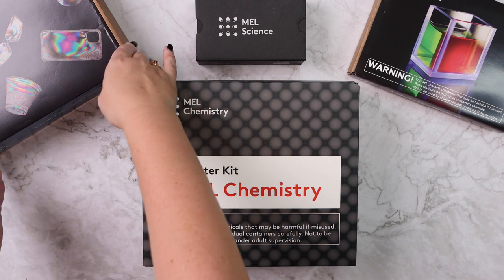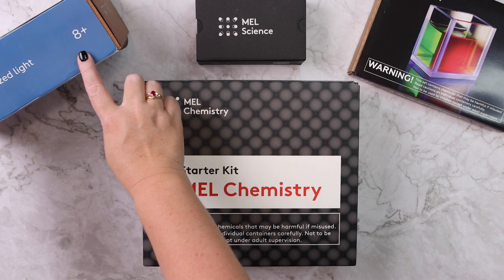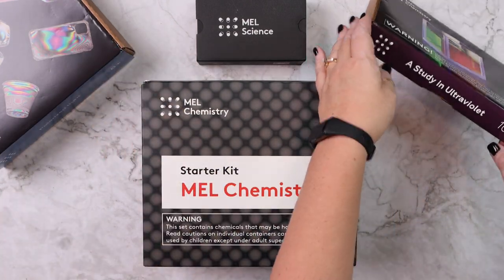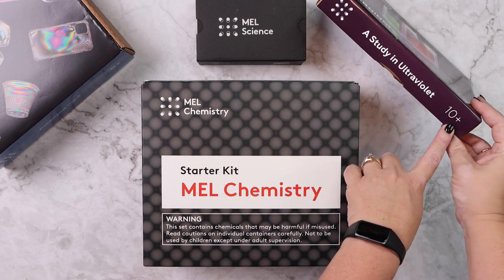The MEL Physics is for ages 8 and up and the MEL Chemistry is suggested for ages 10 and up.